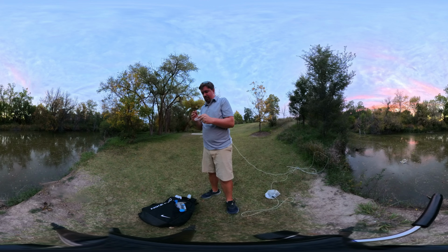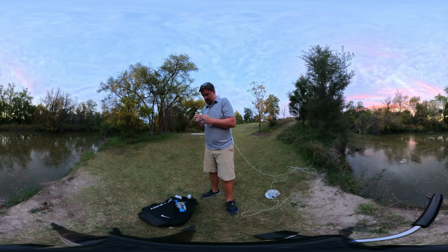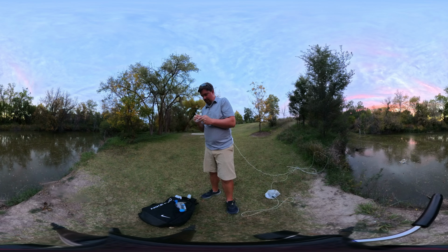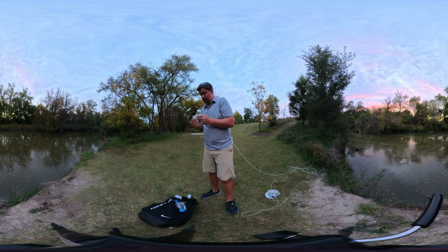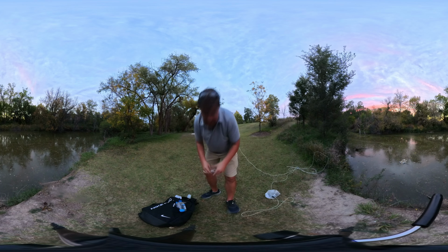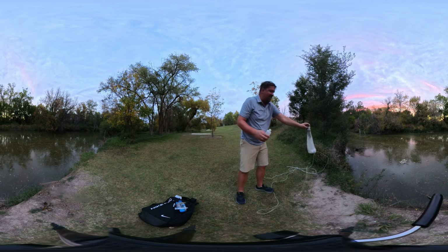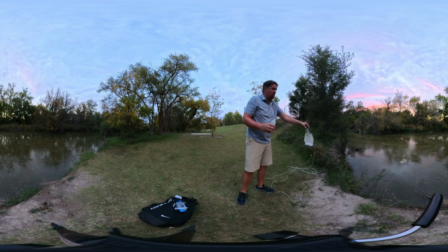Again, I'll label this properly. Big Creek, Hays, Kansas, on the 11th of October. The date is actually very important because people later or in the future will want to know when these bacterial blooms occur, if it is a bacterial bloom in the first place, so that if necessary they can close certain stretches of the park.